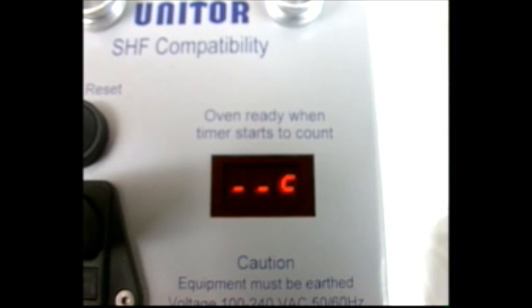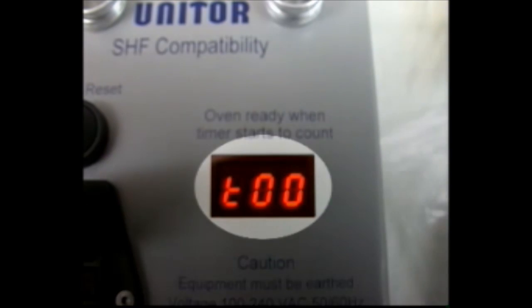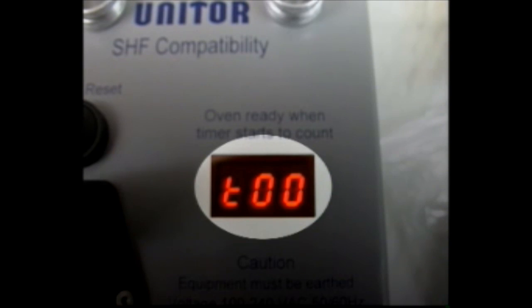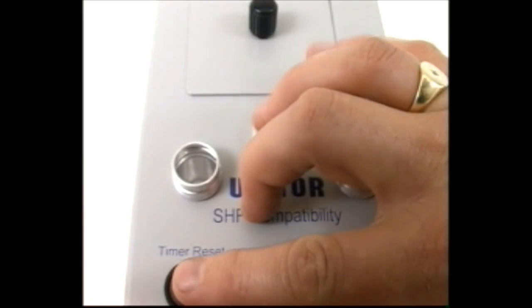When the equipment is heating and is not yet ready to use, it looks like this. When the equipment has heated fully, the timer looks like this. It counts in minutes only, from 0 to 99, and can be reset by pressing the reset button.